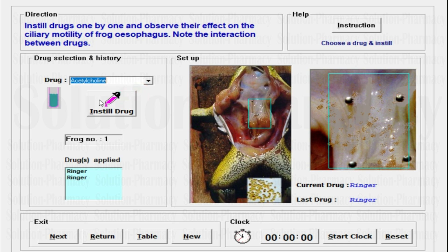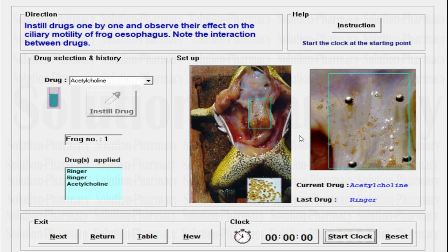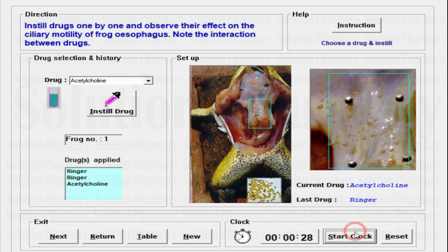Reset the stopwatch, then change the drug. I am going to select acetylcholine. The procedure will be the same: instill the drug, it will be applied over the esophagus of the frog, then pick a seed, drag it toward the starting point, release it, and start the stopwatch. Observe at which time the seed completely falls to the boundary line — that will be the motility time. Lower time means more motility; maximum time indicates lower motility. The effect of acetylcholine is 28 seconds, which is less than the previous 39 seconds — so acetylcholine increases the ciliary motility of the frog esophagus.